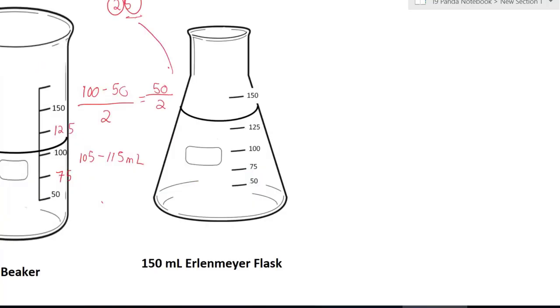Last one. 150 milliliter Erlenmeyer flask. Same thing, you have to find the difference. So 150 minus 125 divided by the number of increments, which is 1. So 150 minus 125 will give you 25 over 1, which is 25.